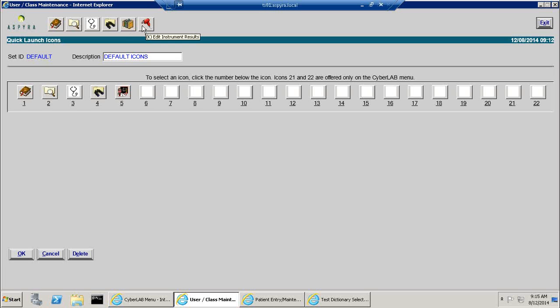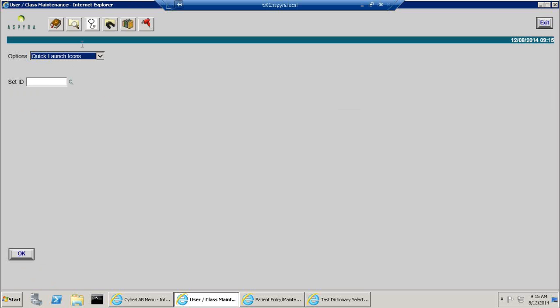It's one of those features that the programmers thought about, but it didn't turn out to be quite as useful. Now, if you know what the hotkey is, you can just do an Alt-W, and if Alt-W is not some other menu item or other thing, then it will take you right to those worksheets. So it is useful in that aspect. Some of the other things that you can do, let me just cancel this and we'll go into mine.